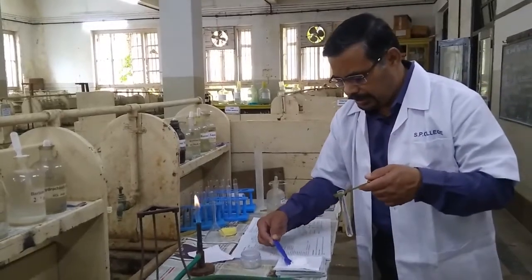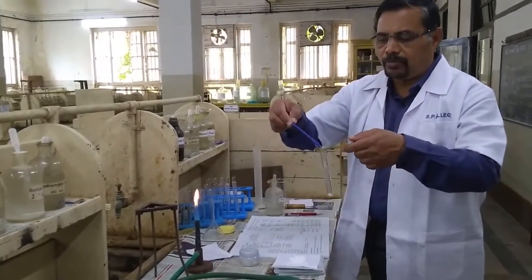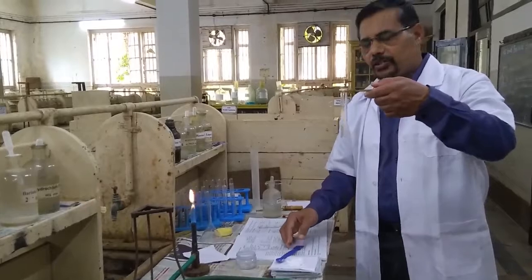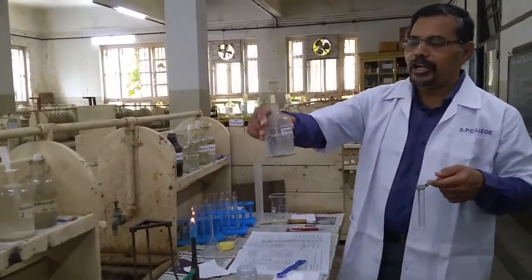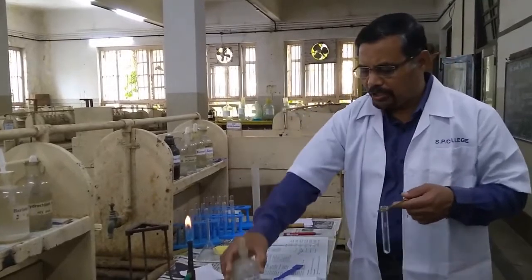So I will take a small quantity of the given mixture in the test tube. Then I will add a small quantity of dilute NaOH.